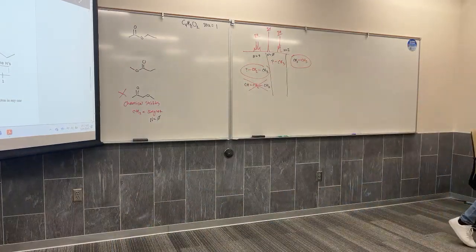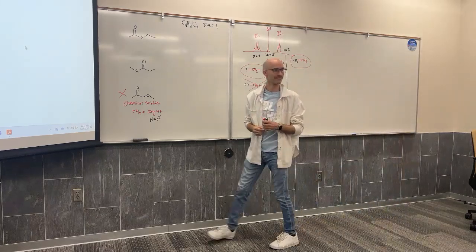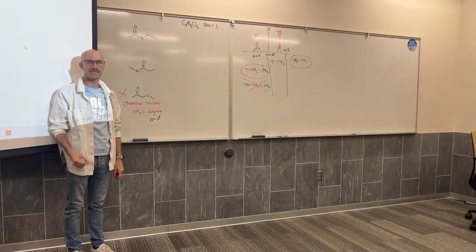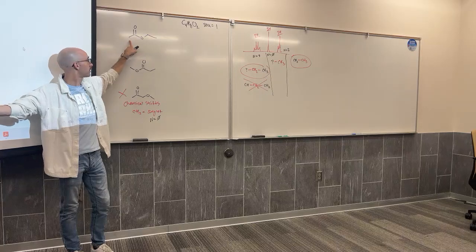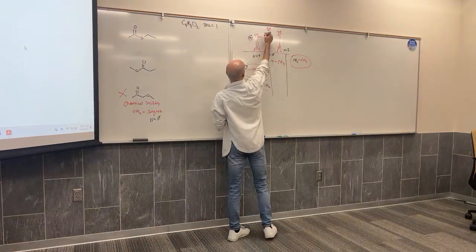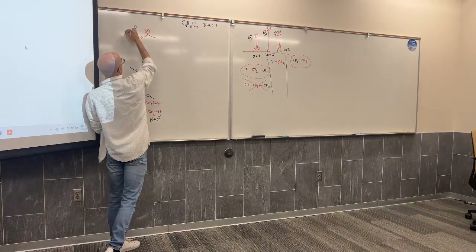What do we see? Which of those two structural isomers matches this NMR best? A or B? Okay. Top one. CH3, further to the right, because it's close to the carbonyl. CH2, further to the left, because it's close to the oxygen. So if we were to label these signals A, B, C from left to right, and then map them to our molecule, this is A, B, C.